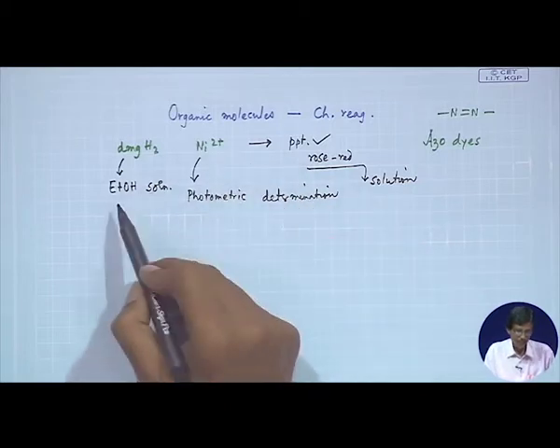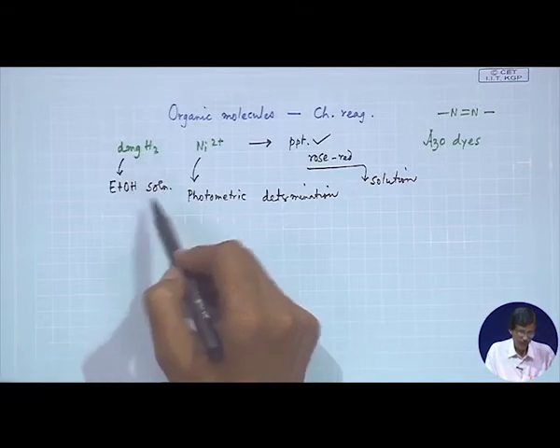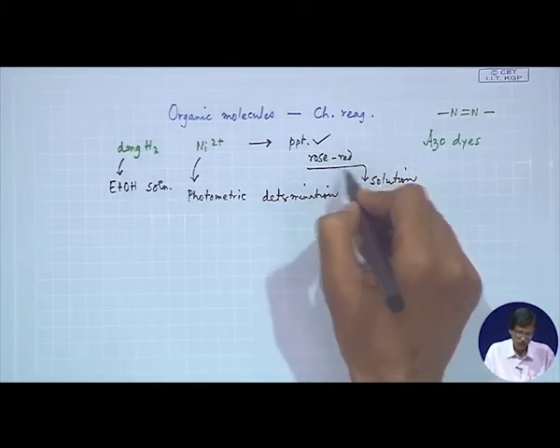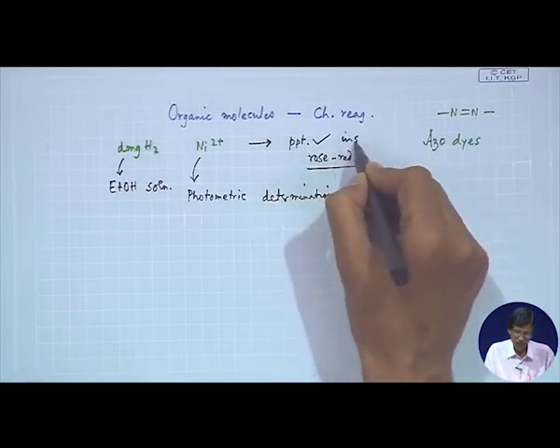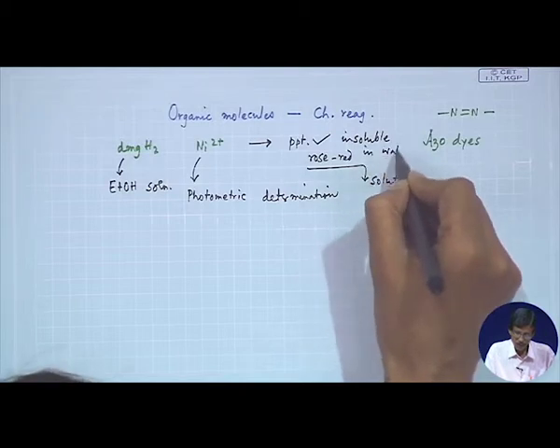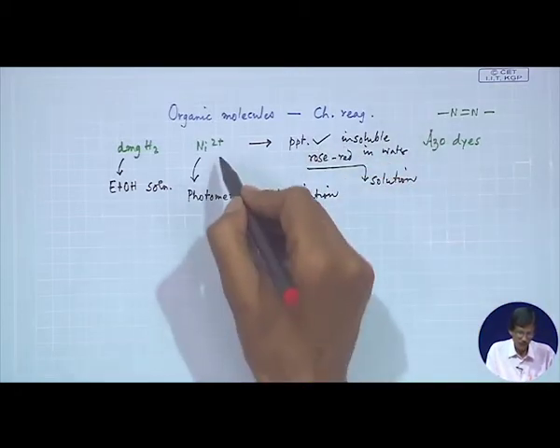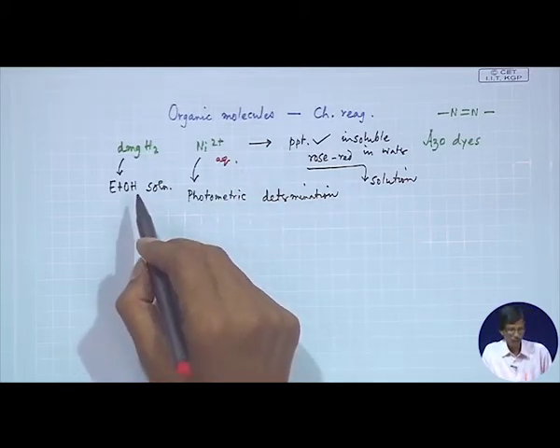That means 10 milliliter of alcohol is fine to dissolve that corresponding amount of DMG, which is diluted to 100 milliliter. Now, if you see this color, and some small particles, because we have seen that this particular product is insoluble in water. So, it is insoluble in water. What precaution should we take for avoiding this precipitation, if we do this in aqueous solution and this is in alcoholic aqueous medium?